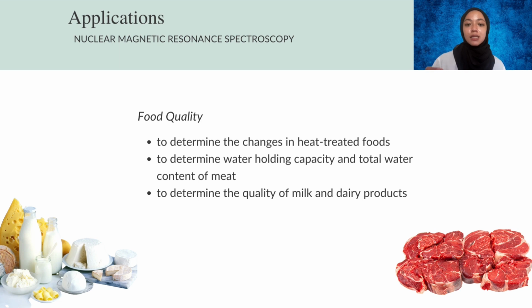Studies were conducted on the water molecules of casein systems, serum proteins, and milk powder by NMR technique. Furthermore, NMR applications are used to determine the characteristics of cheese. Nuclear magnetic resonance is used to monitor the maturation and evaluate the modifications of amino acid and water content in cheeses. That's all from us.